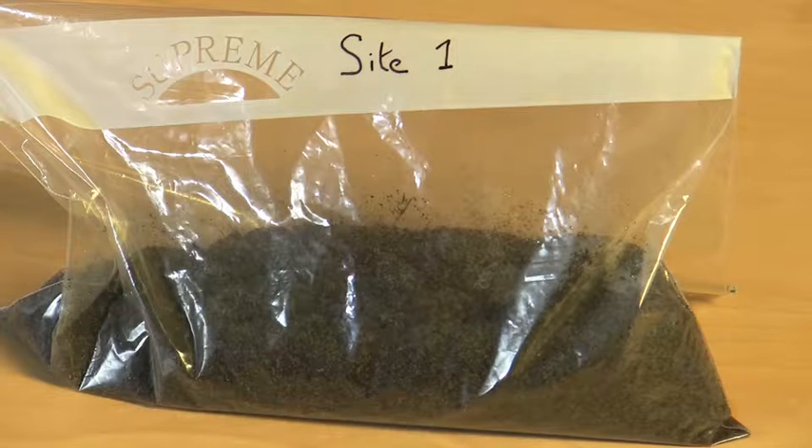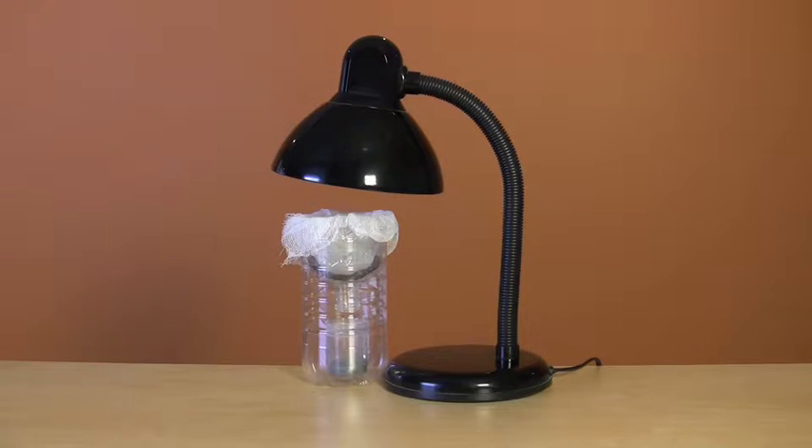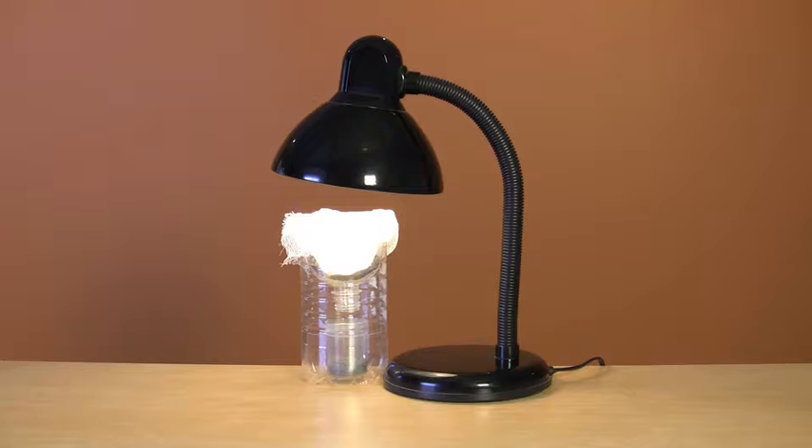Now you've got your sample, I'm going to show you how to separate the animals from the soil. You can do this by using the heat and light of a lamp. This is a Tullgren apparatus. Soil animals are highly sensitive to desiccation, and while they're escaping from the heat, they end up falling into the collecting container below.